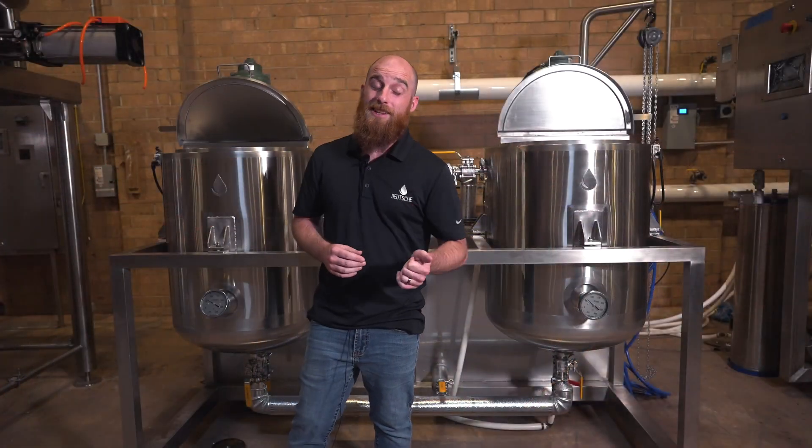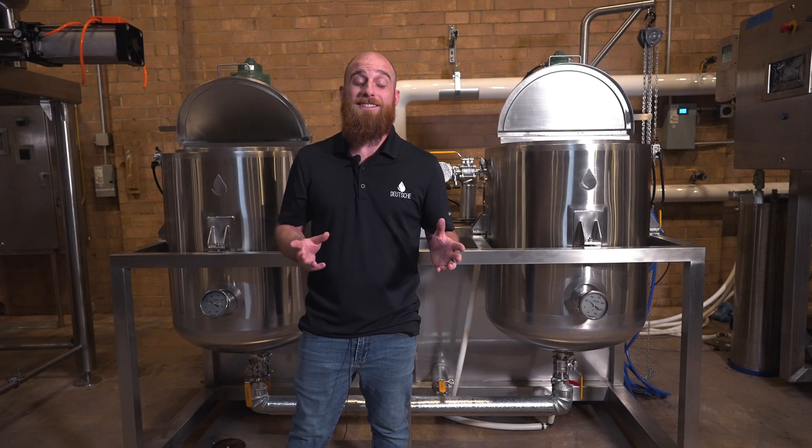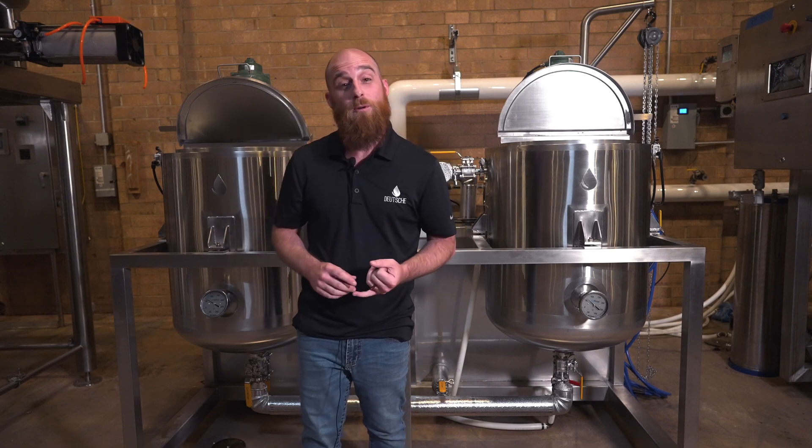Once your oil comes out of the lenticular filter, the winterization process is more or less done, and now you begin the fine art of evaporation and distillation. But if you're interested in learning more about extraction, winterization, post-processing, distillation, or evaporation, give us a call. We're here to help. I'm Andrew Bouchard, and this is the Deutsche Download.